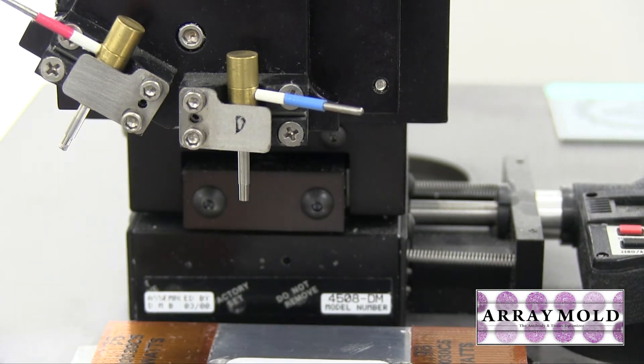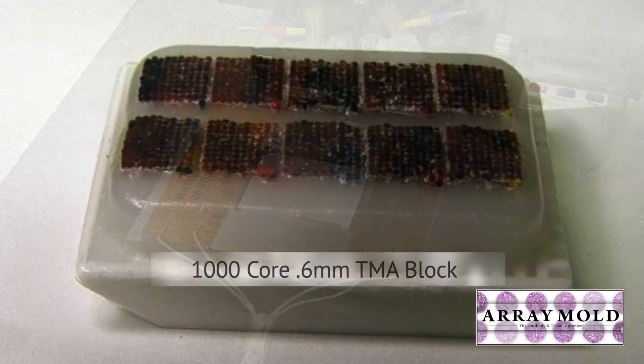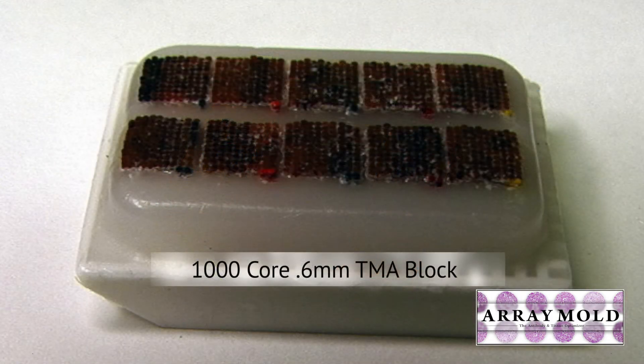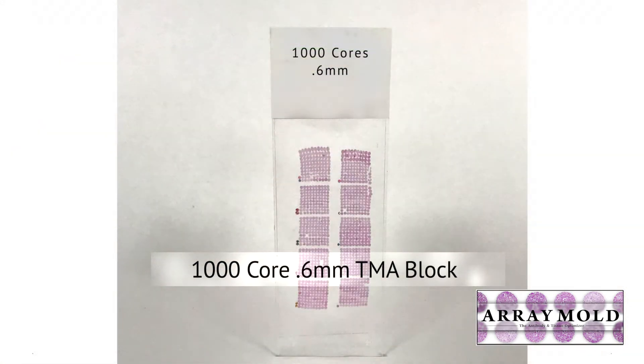I actually added heat strips on the sides which heated the plate and softened the paraffin, making it easier to punch. That allowed me to add a lot of samples — as you can see in this picture here of 1000 0.6-millimeter punches in one tissue microarray block.